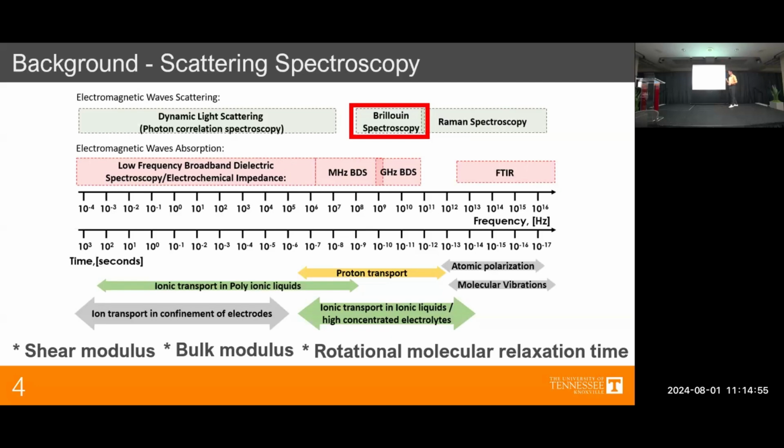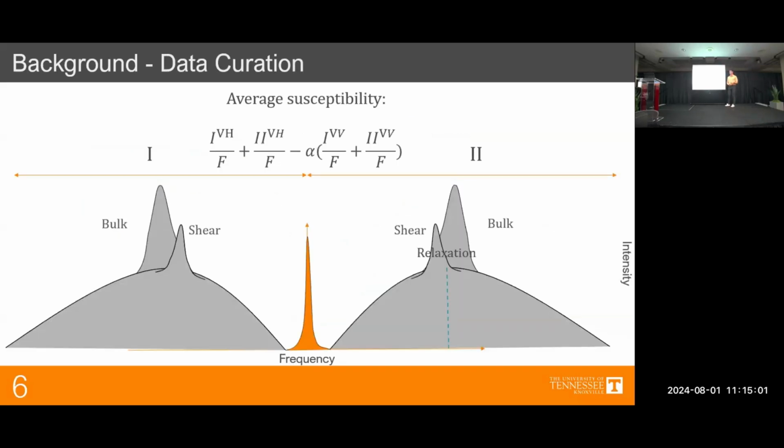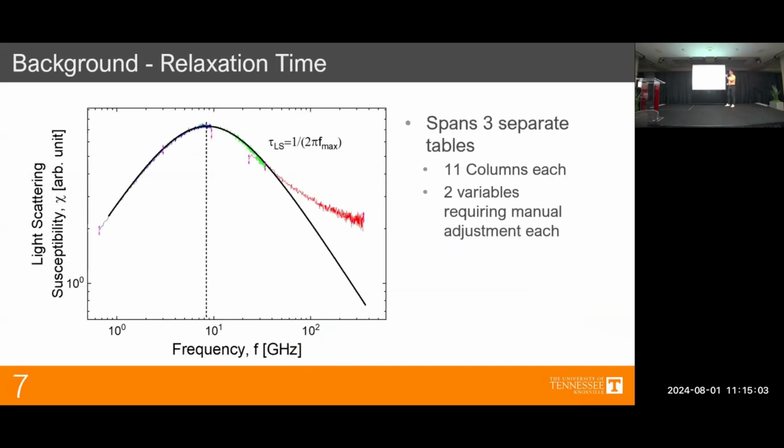But if you were to do a full data treatment of the entire spectrum, it was a very wide curve. It's kind of hard to show this with hands, but ideally, if I included the full spectrum in my program, I would pretty much be widening it, and it would just show the other curves as well. So I would be including data treatment of the other spectroscopies from the raw data.